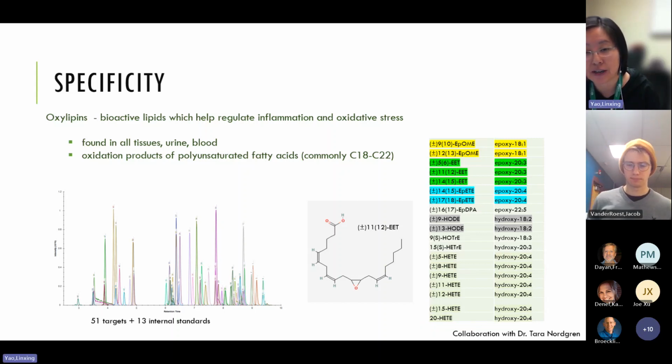For this kind of analysis, we need to pay special attention to the method specificity. First of all, we need to enable the best possible separation on the LC column. So we tried columns of different dimensions, and tried different buffers and gradients, which resulted in the chromatogram presented here.